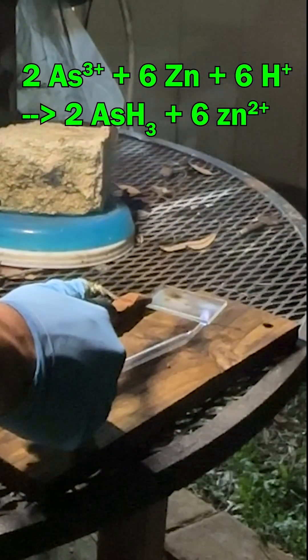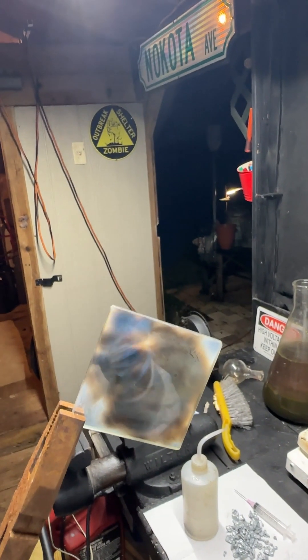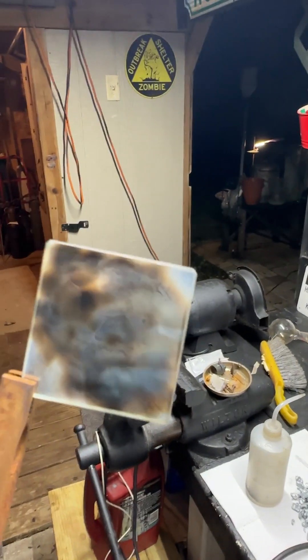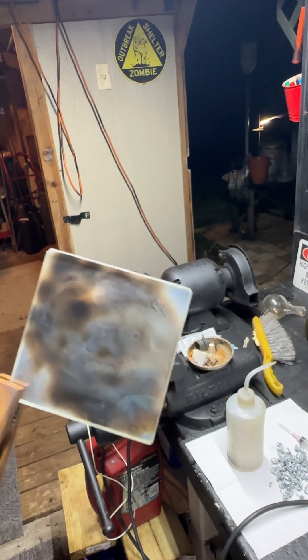I then ignited the gases and placed a small glass plate over the end of the flame. So by the looks of it, I would be dead. This is actually an arsenic mirror — you may be able to see my reflection in it. This is due to elemental arsenic building up on the cold plate as the arsenic burns with the hydrogen, forming elemental arsenic. And that is how you detect arsenic 1800s style.